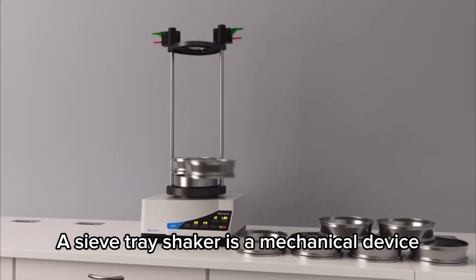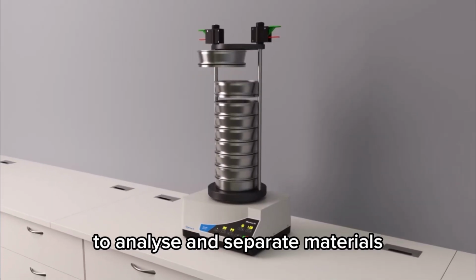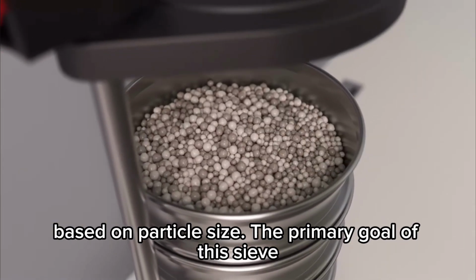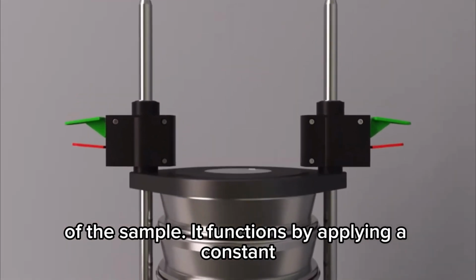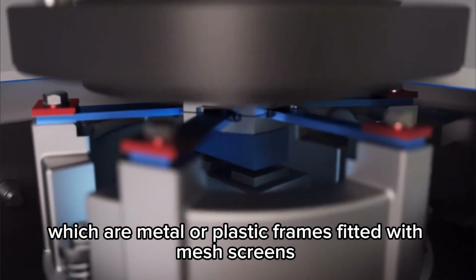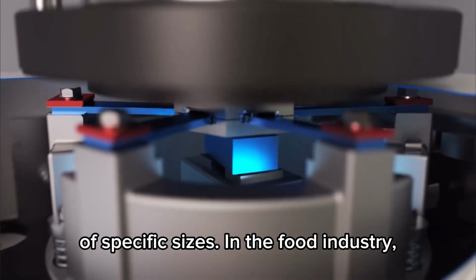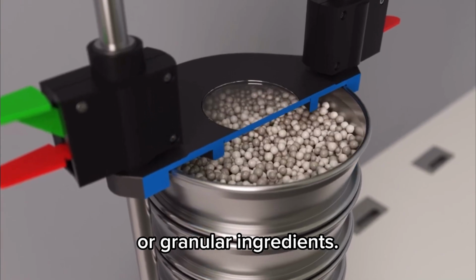A sieve tray shaker is a mechanical device widely used in laboratories and industrial settings to analyze and separate materials based on particle size. The primary goal of the sieve shaker is to determine the particle size distribution of the sample. It functions by applying controlled shaking or vibrating motions to a stack of sieves, which are metal or plastic frames fitted with mesh screens of specific sizes. In the food industry, they help control the size of flour, sugar, and other powdered or granular ingredients.